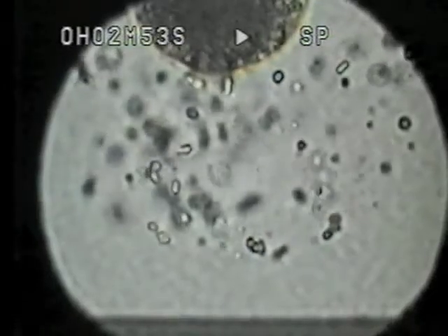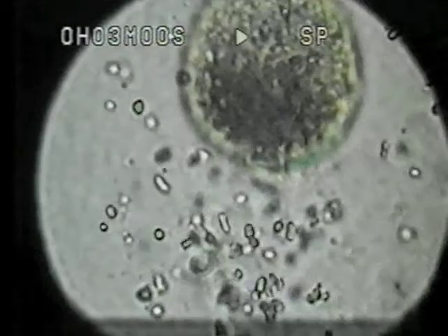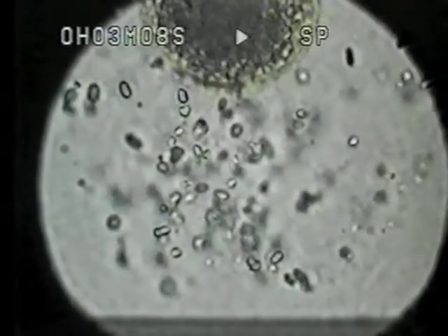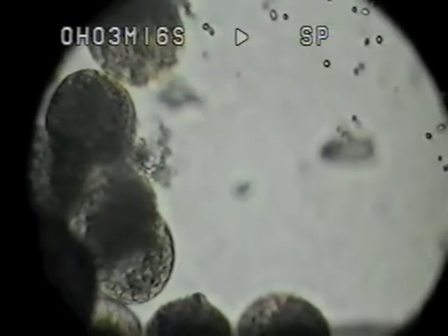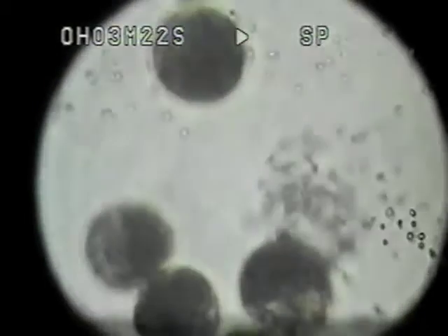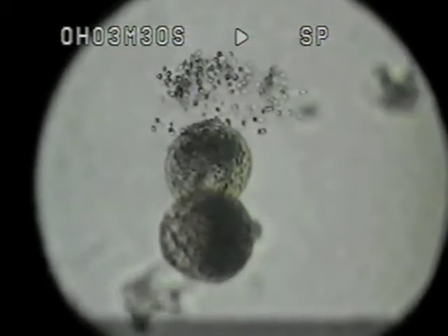Now we can get a close-up view of that — there it is popping out, it's fascinating. Now we go back to the low power and look around — they are all popping now. The time is 1 minute 52 seconds, and you can see them all over the place. So this is what would happen with a shower of rain — they would break up quite quickly.